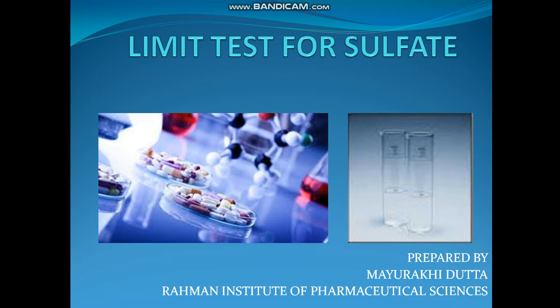Hello student, I am here to discuss limit test for sulfate. In this class, we mainly focused on principle and procedure of sulfate limit test.